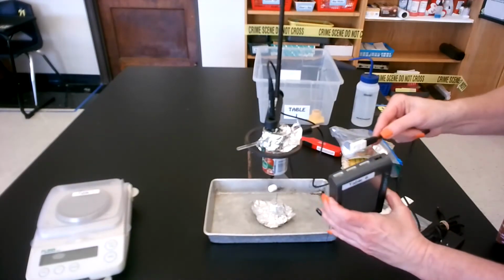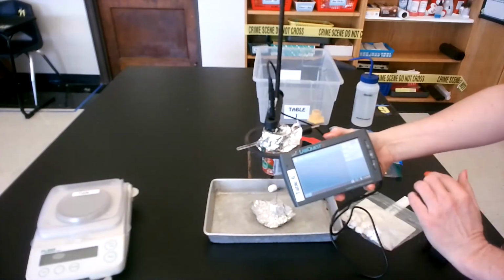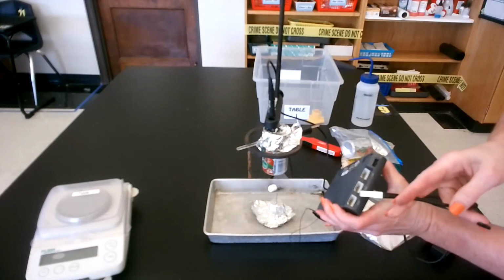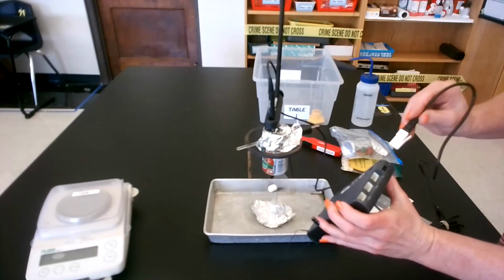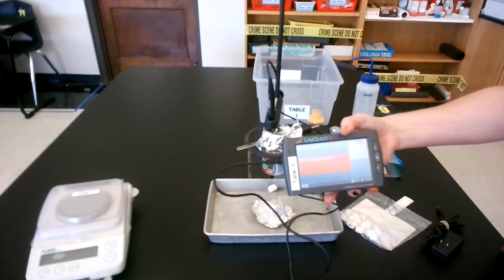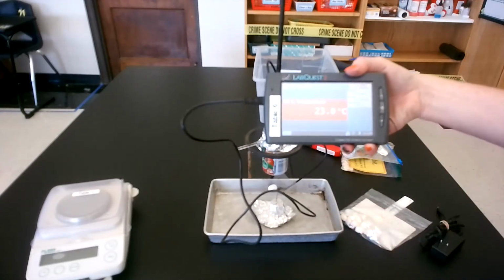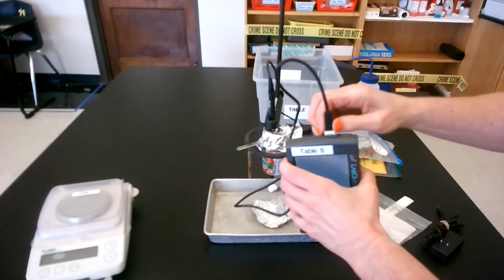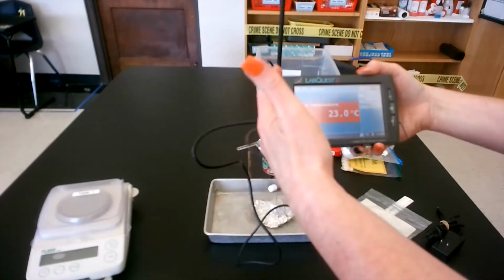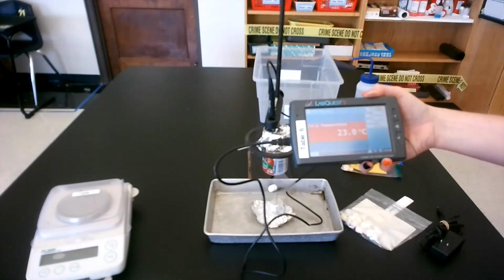So what I'm going to do is find the connections all the way around this, okay? So here's the power. If I'm looking at it straight on the right, here's the power plug-in. And then on the other end, it says channels. Let's just go with channel 1. And I'm going to put it in until it clicks, okay? Then it will pop up, and if it's working right, you'll notice that it says 23.0, in degrees Celsius. If, for instance, I accidentally put it in channel 2, it's just going to change here. So I can plug in actually 3 thermometers, but the channel doesn't matter as long as it's clicked in and you notice that it's working.